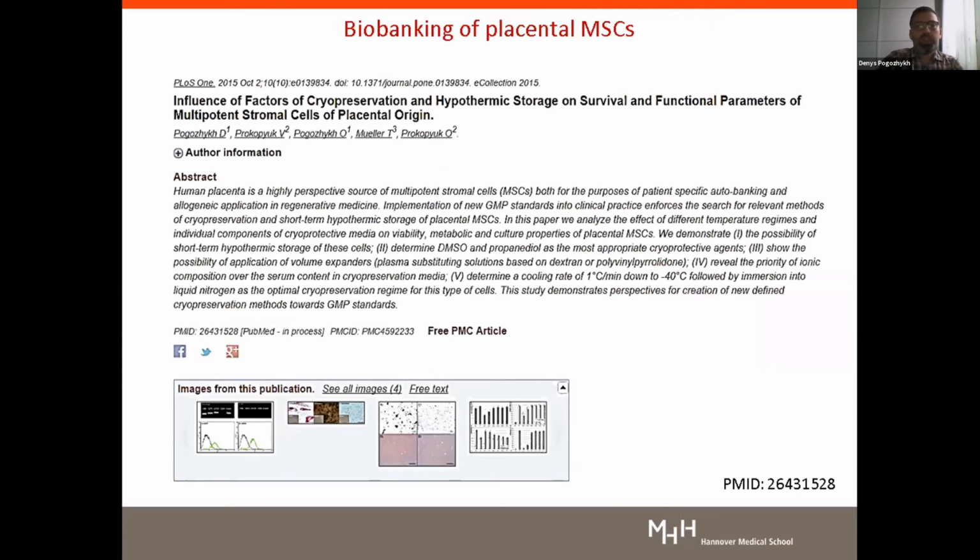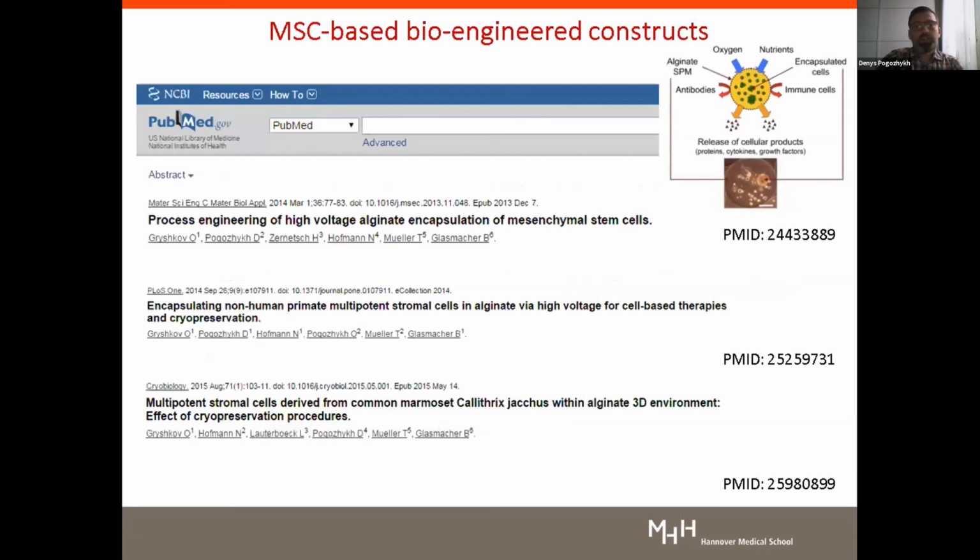We also investigated the possibility of hypothermic storage with alternative cryoprotectants and so on. This is also an open source paper. You can have a look if you need more details, or you can ask me later. But very important also, besides just suspensions, are bioengineered constructs on MSC-based products.